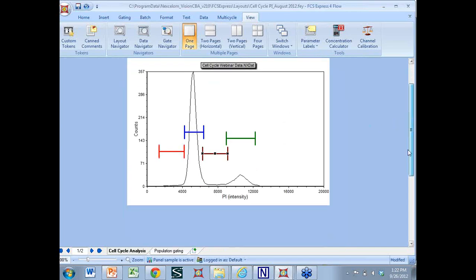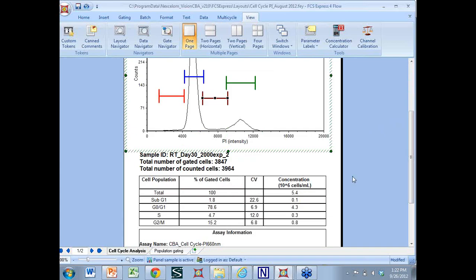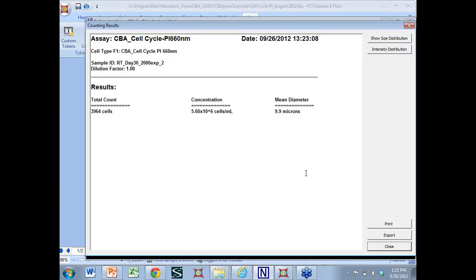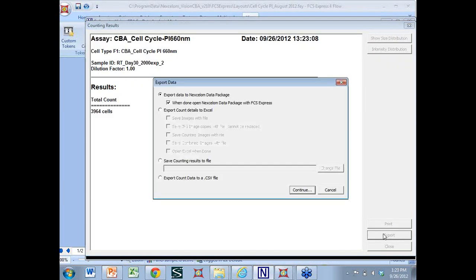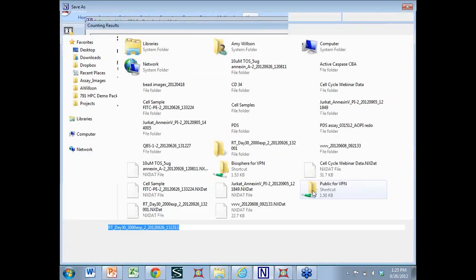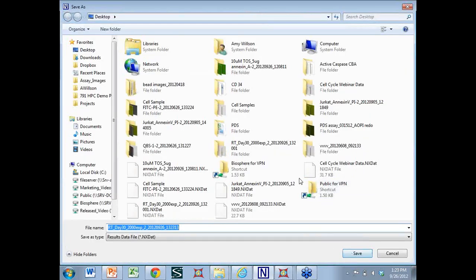Yes, thank you for the wonderful presentation there. I was hoping that maybe you'd be able to show the export screen from the Nexcelom software one more time rather quickly, just so we can take a look at that. So what we have here is we click on the export button, and you'll notice here, if you don't mind going back to that real quickly, Amy, back one step.